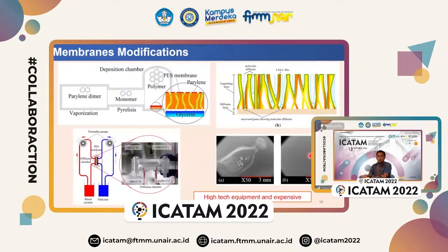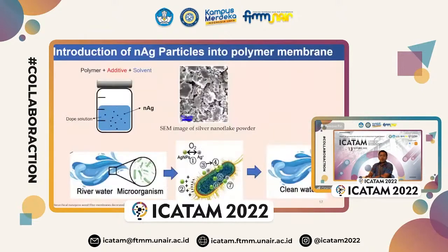So this method is good, but the only problem is it needs high tech equipment and is very expensive. Not every lab has this kind of plasma coating machine. Not every lab has the DLC coating machine. Also, it needs a lot of money to make this material modification. Therefore, we try to do some simple modification.